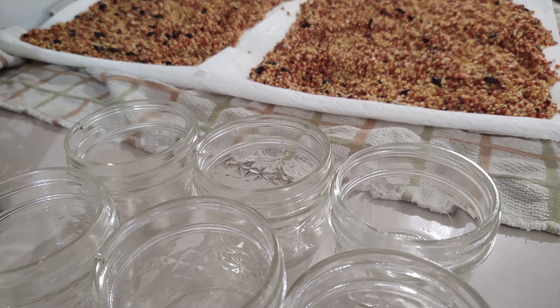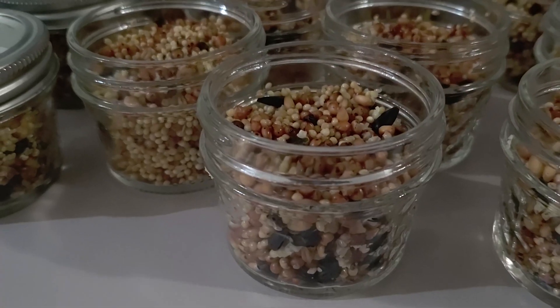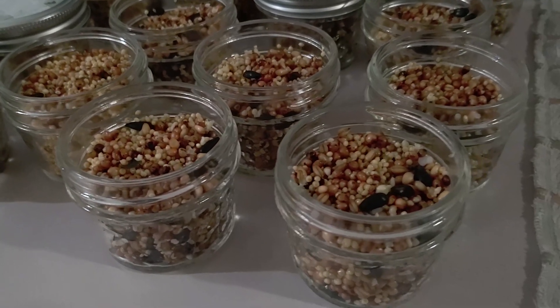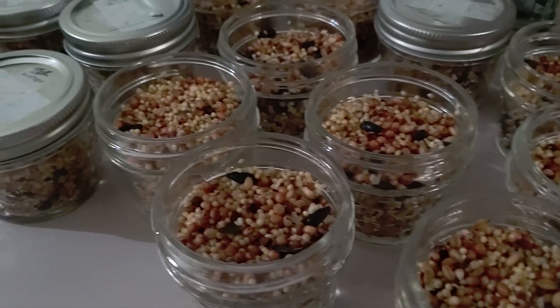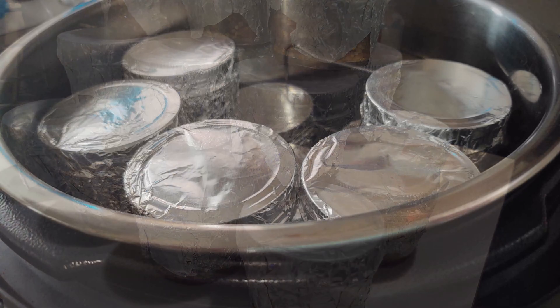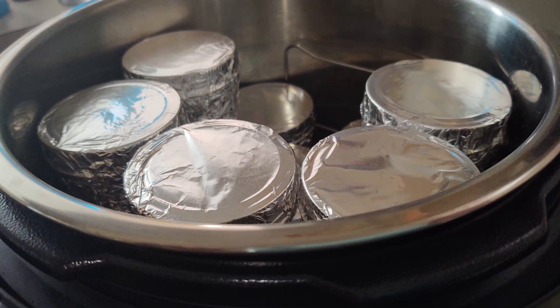When adding the bird seed to your jars, make sure not to fill them all the way so you have plenty of room to add your agar, spores, or liquid culture, and to shake them. Simply cover them in foil, then pressure cook for 90 minutes at 15 psi.